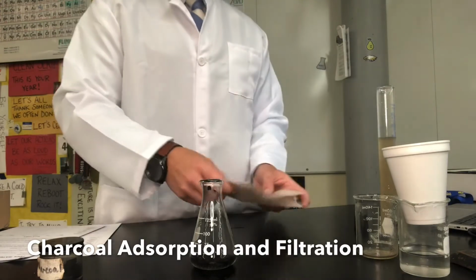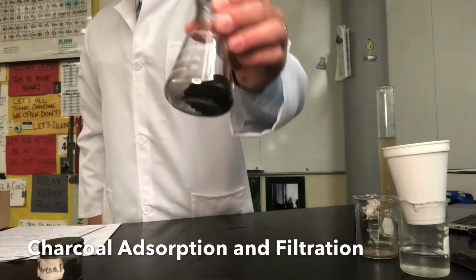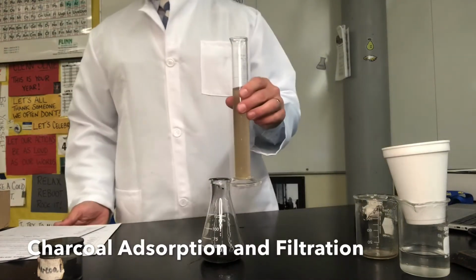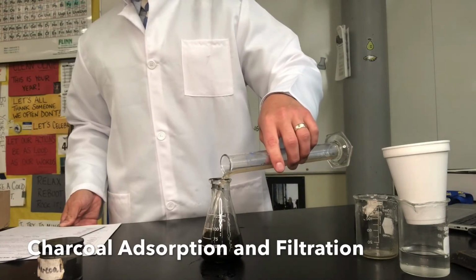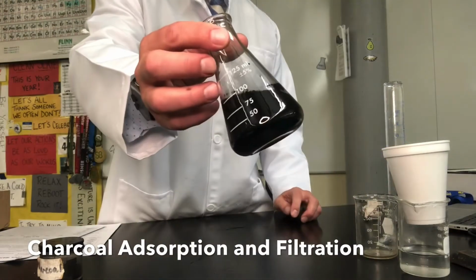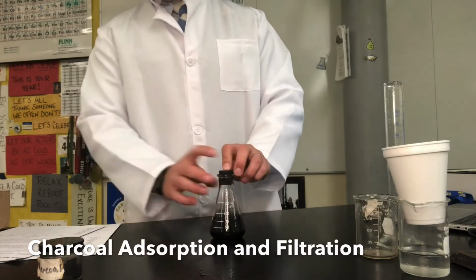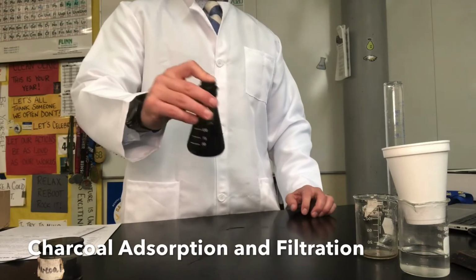Nice. Okay, if we didn't make too big of a mess, that's great. Now we have our black charcoal in there. And now I'm going to take our water sample and I'm going to put it inside the charcoal. Now you might be thinking, wait a minute, we're supposed to be cleaning this. This doesn't look any cleaner. Now the liquid is black. Well, that's true, but we're going to stop at the top. We're actually going to swirl this around for a good couple of minutes.